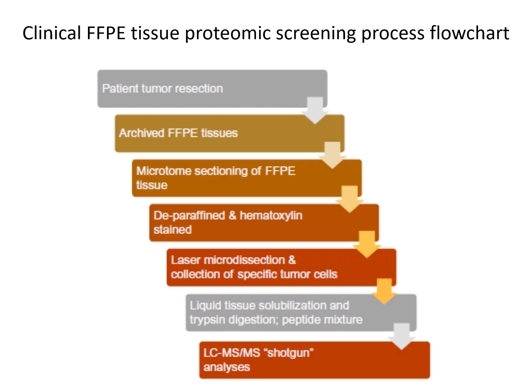However, recent technique development has proved that the FFPE sample represent an excellent resource. There is also the advantage of linking results with relevant clinical data, including long-term outcomes or response to treatment. And the use of FFPE tissue sample will allow sufficient number of cases of some of the rare disease or clinical subgroups to be assembled for analysis.